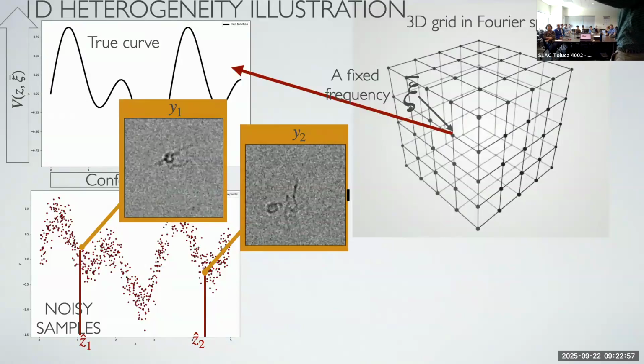On the x-axis, we have the label that we computed from the previous step. And on the y-axis, it's really just the pixel value. Even if I did a perfect job on the first step and I know exactly where to put them on the x-axis, there's still going to be a lot of noise on the y-axis just because the images themselves are very noisy.